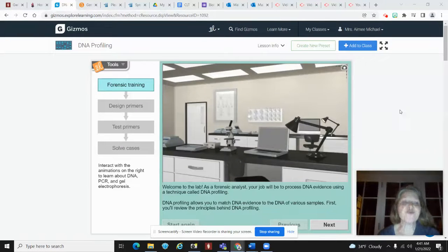Hi, this is a short video on DNA profiling and just the basics on how it works. And I'm using Gizmos to demonstrate this. DNA profiling is based on just a section of DNA from organisms.